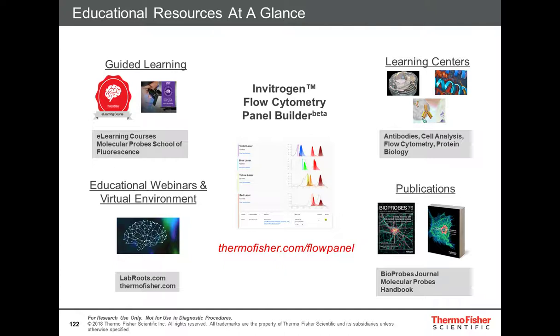And what is the difference between compensation, spillover, and spillover spreading? That's a very good question. So I really don't like the terms.